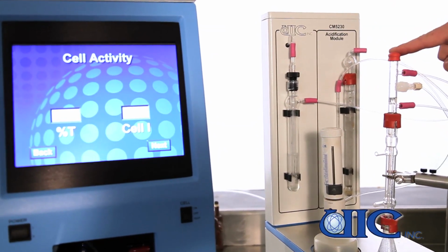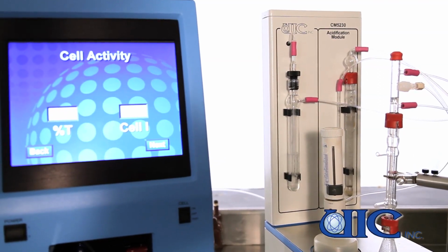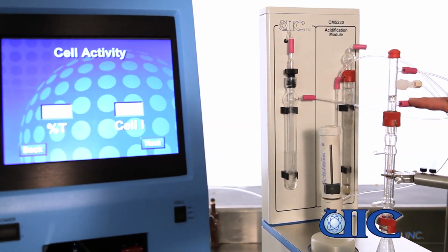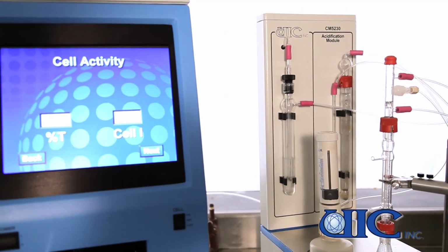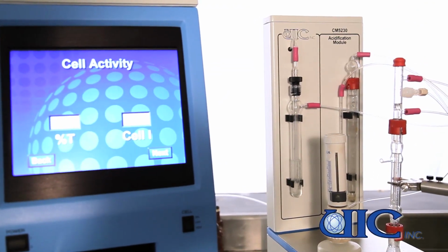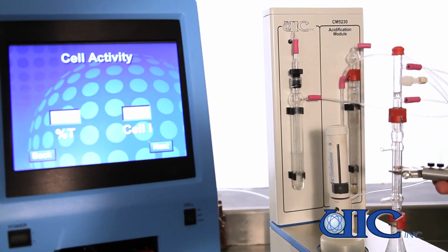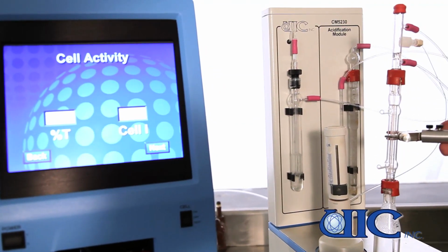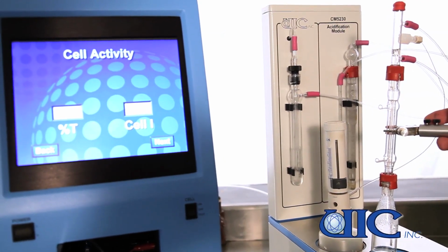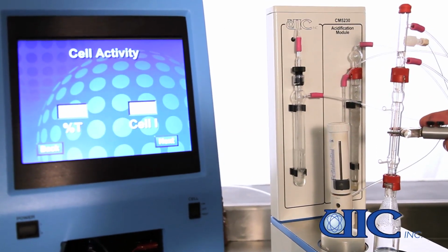The sample column adapter also includes a septa for injecting our liquid samples. It also has an acid inlet for our acid pump, and then an outlet where the carrier gas comes out and goes on to our post scrubbers. Part of this column is the sample column adapter, the condenser, and down here the sample flask. The sample flask is in a heated compartment that has a magnetic stirrer also at the bottom. The stirring helps with the sample reaction and helps mix the sample in with the acid solution.